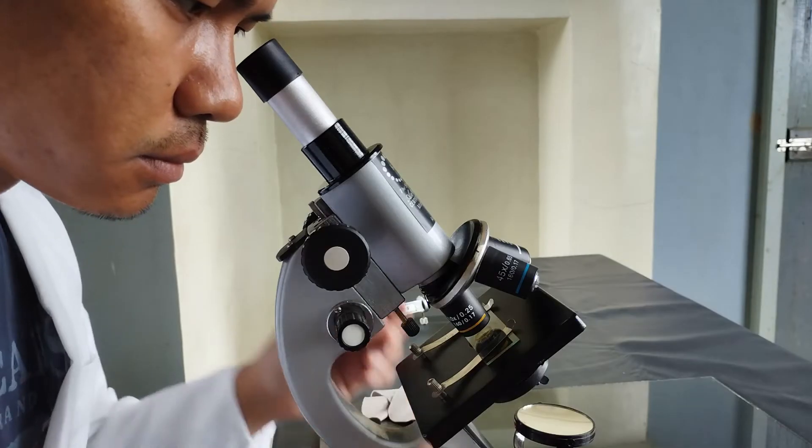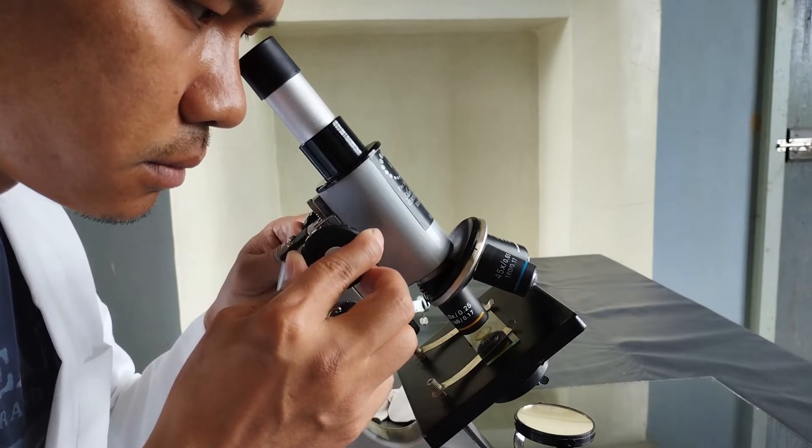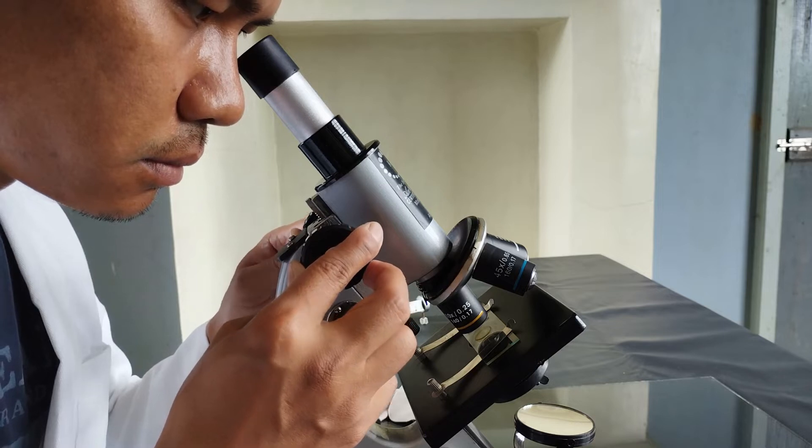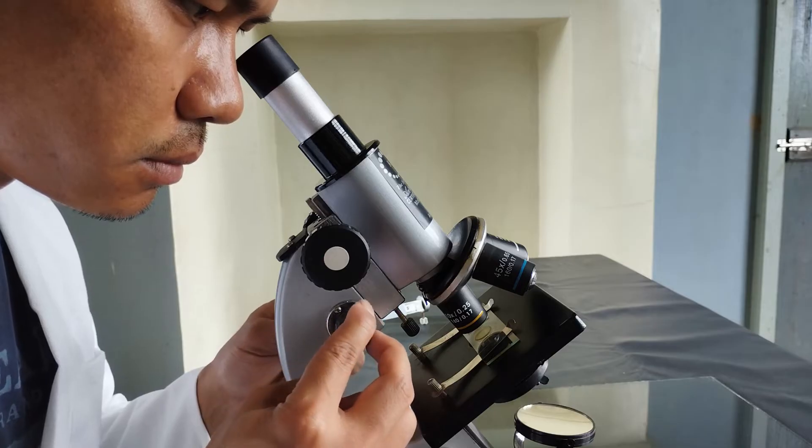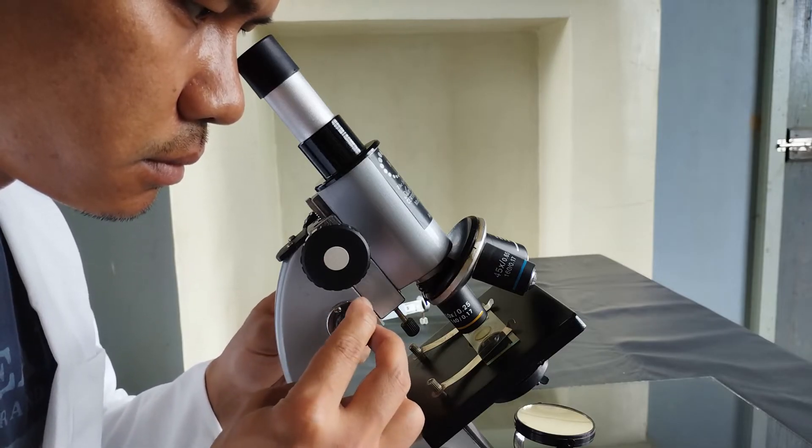Then carefully rotate the coarse adjustment knob counterclockwise until the specimen becomes visible and is more or less in focus. Once the specimen comes into view, use only the fine adjustment knob to bring the specimen into sharp focus by rotating the fine adjustment knob clockwise or counterclockwise.